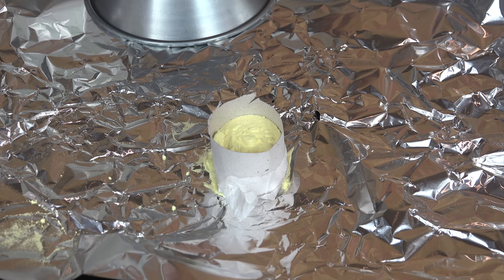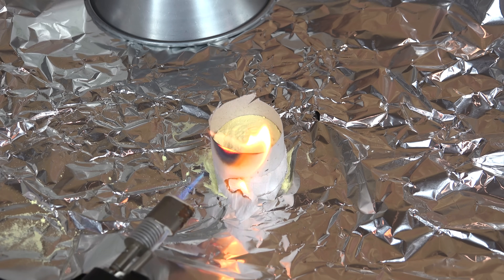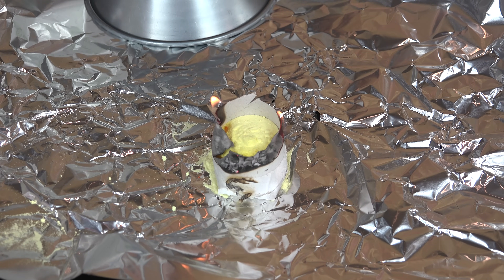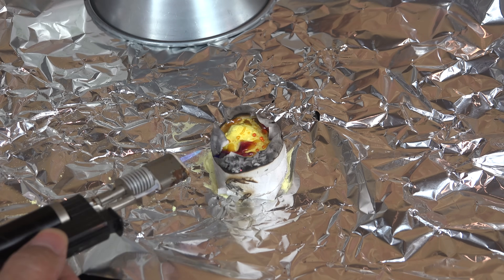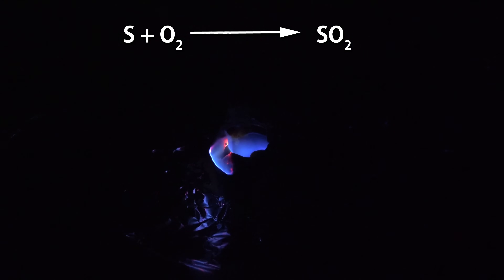The first and by far the cheapest method is simply to burn sulfur. I have it packaged in a toilet paper roll to make a crude sulfur candle, and all we have to do is set it on fire. It does need to be molten for the flame to be self-sustaining, but that isn't too hard to do. Elemental sulfur is actually rather easy to get for gardening uses and pest control. The flame is very dim but it is there and it can be seen if you turn off the lights. The reaction is very simple — it's just combusting with oxygen to make sulfur dioxide.